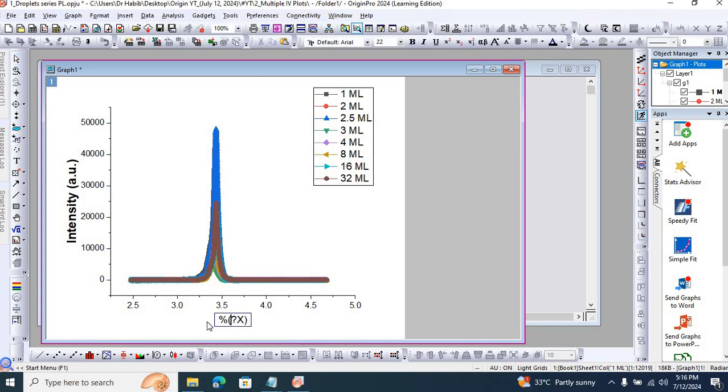Similarly, on the x-axis, my independent variable is energy in electron volts. If you focus closer on these plots, the actual results are in the range of approximately 3.2 to approximately 3.55, I would say 3.2 to 3.6 electron volts. So I'm going to change this scale.